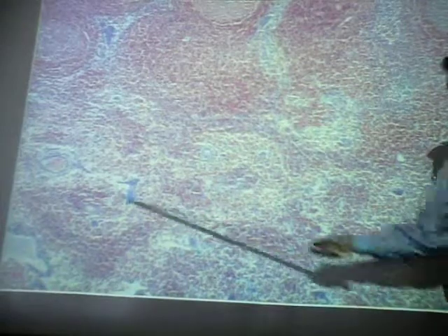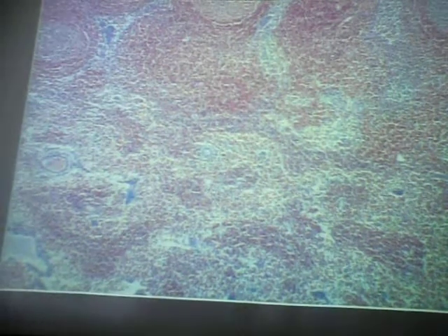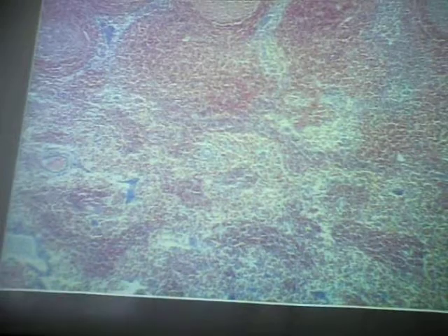And again, what's the fluid passing through here in these sinuses? Lymph, not blood. Please be careful. Think about what the organ does. It filters lymph, the lymph nodes, not the blood. Okay? Out here in the cortex, there's some very distinctive features.